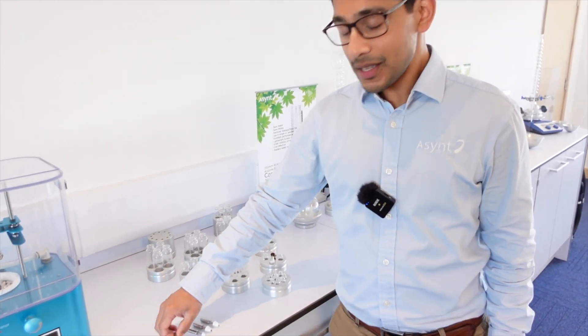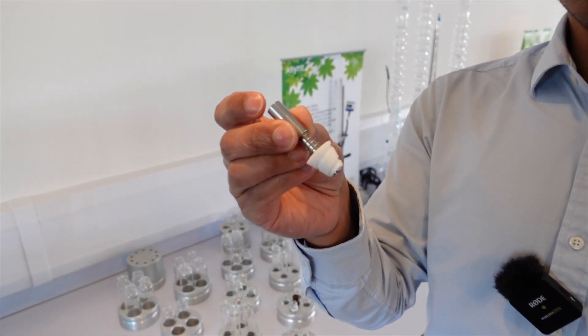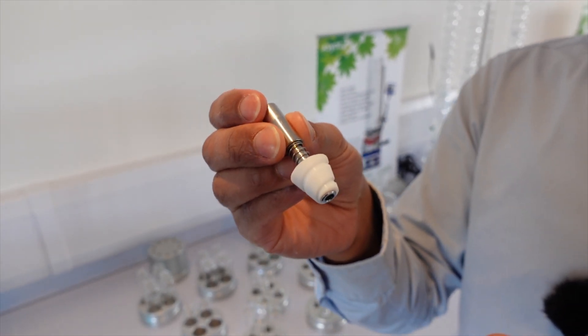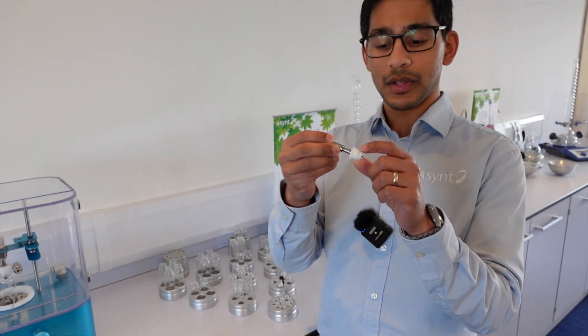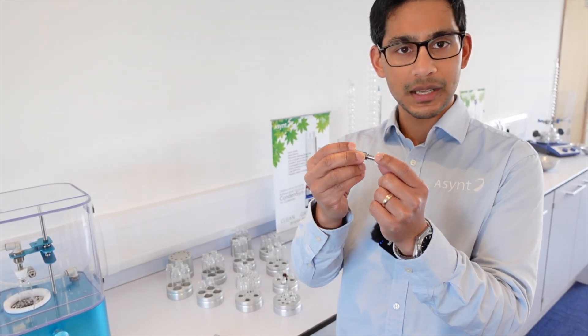Hi, I'm Aaron from Asynt and today I want to talk to you about spiral plug technology. These are a patented technology from our partners in Japan called Biochromato, and they are an incredibly effective tool for evaporation and concentration of samples because of this unique technology where you've got grooves cut into this PTFE plug.